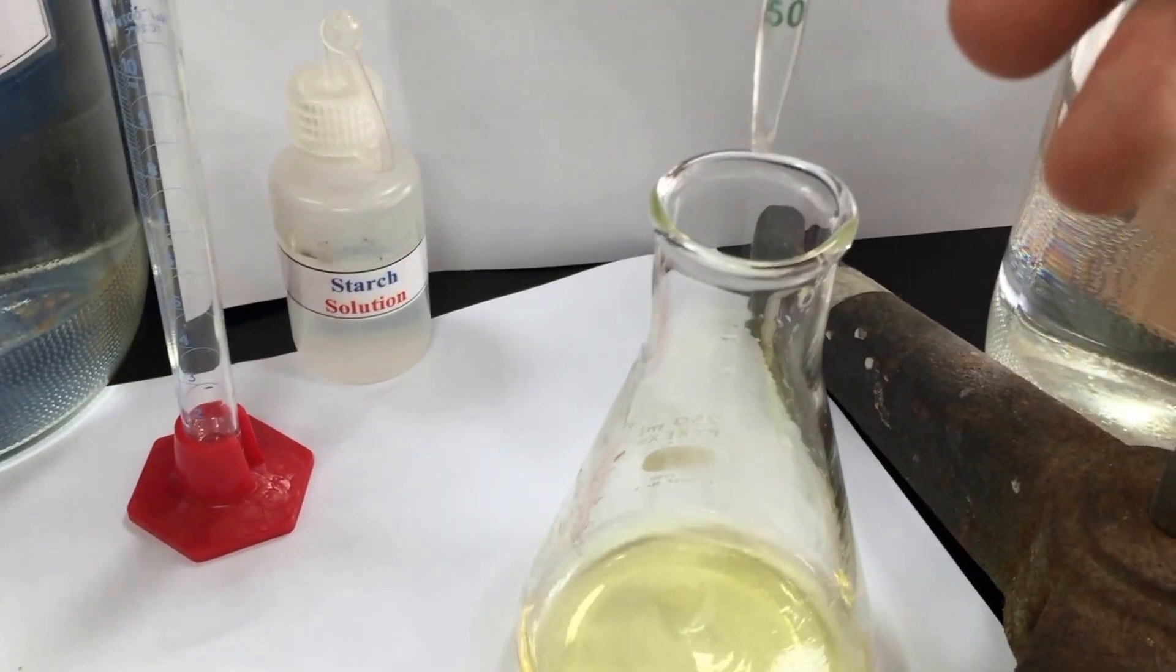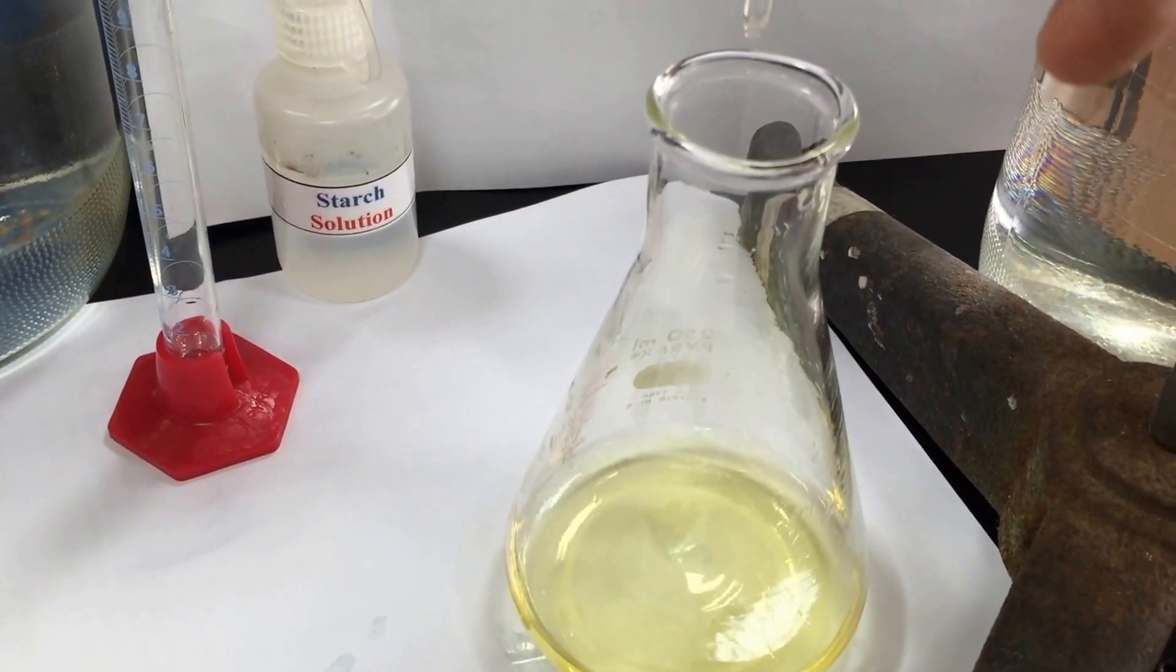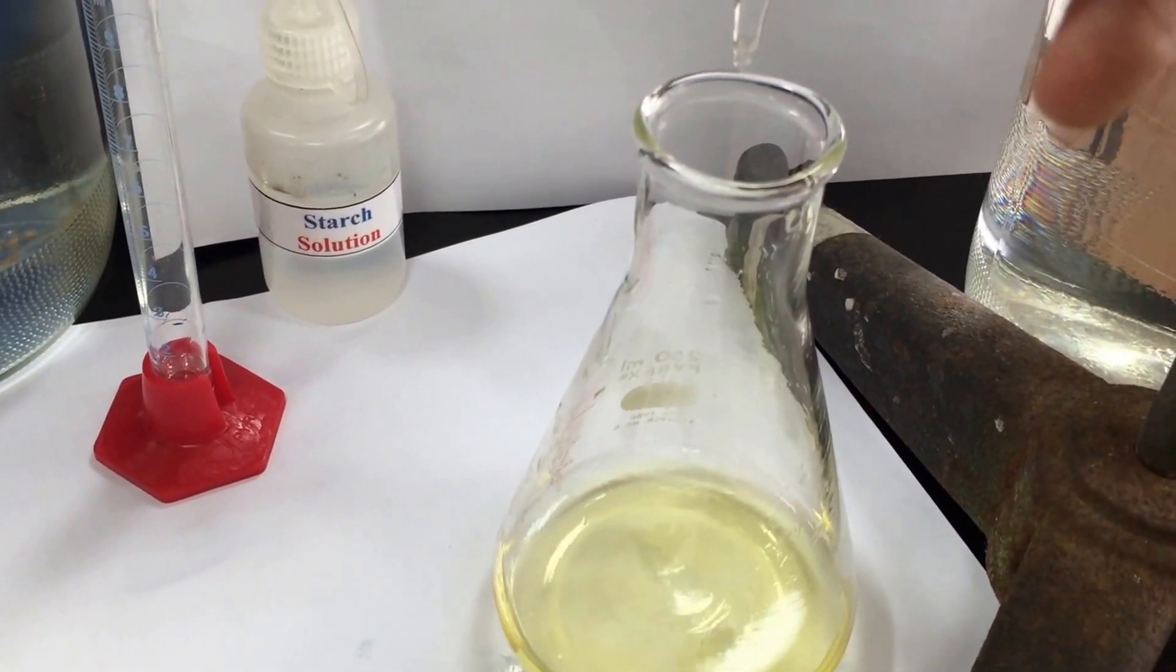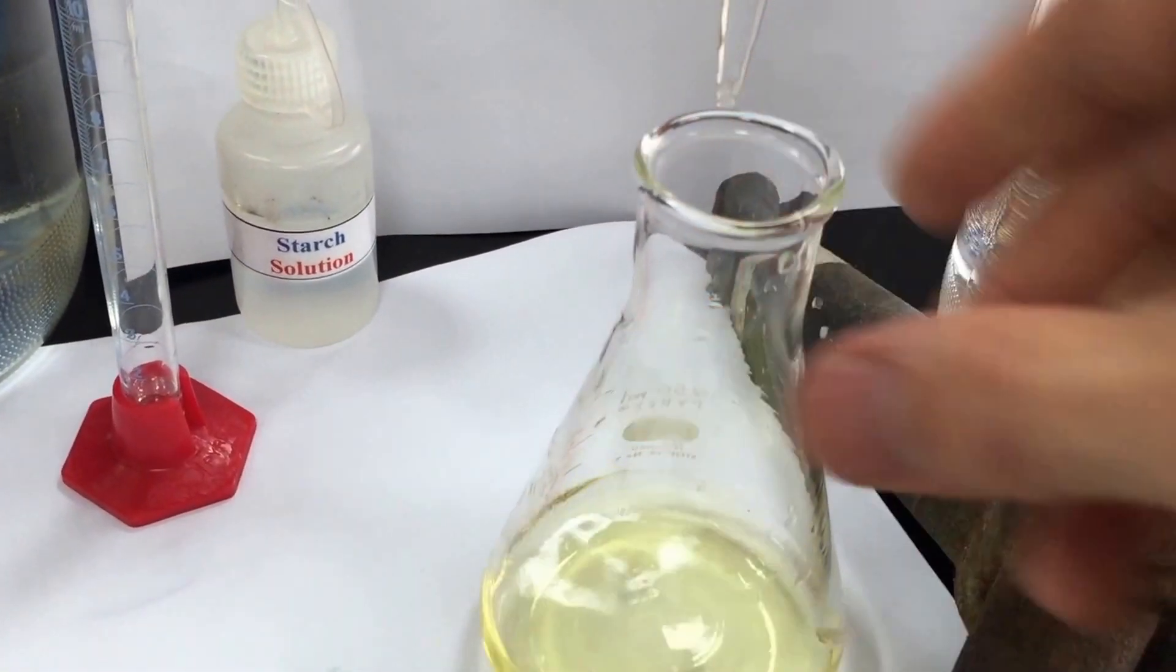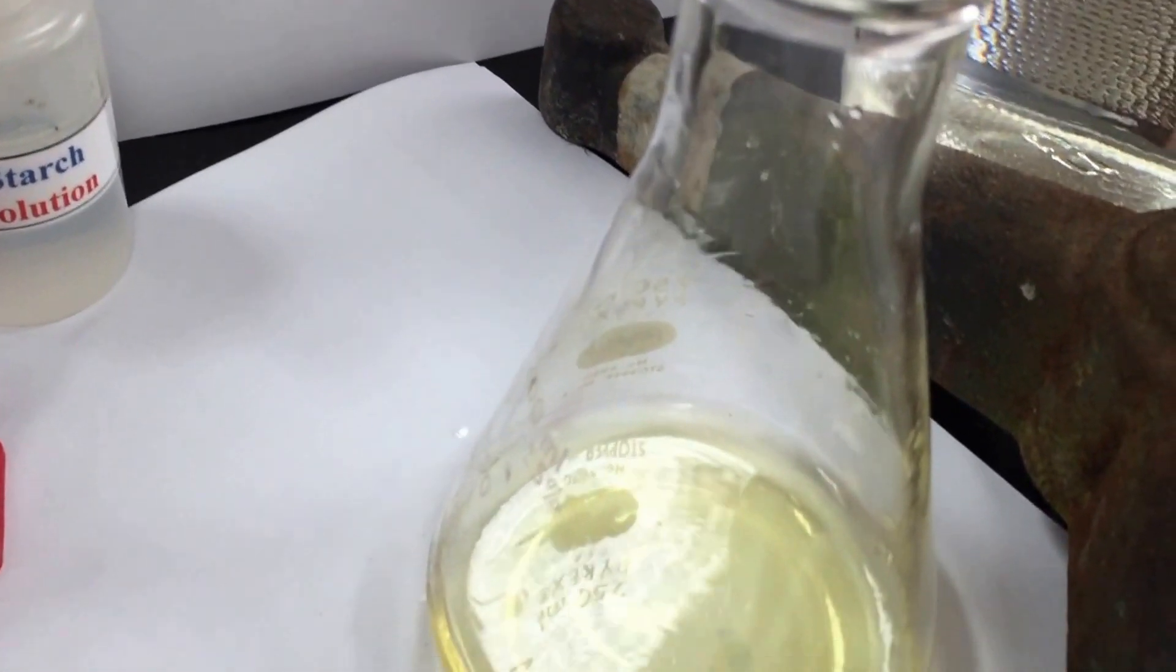I'm going to try to do this one-handed. So remember, we're just trying to get colorless or close to colorless. We don't want to go too far. Now, I've already done two or three titrations, and I know that I should have done the math here.